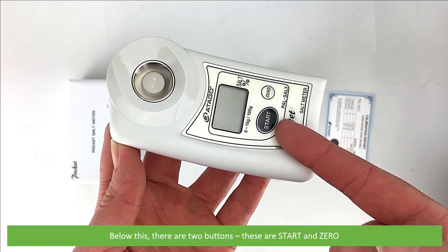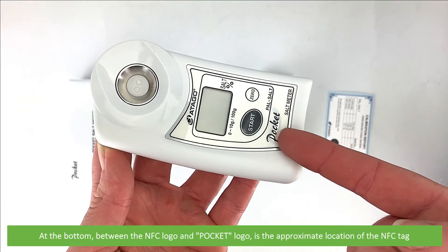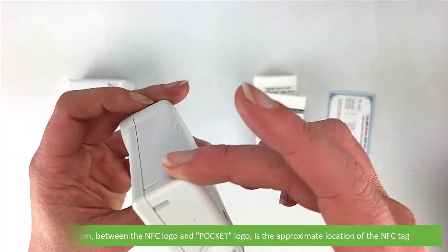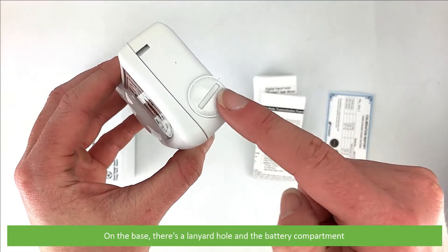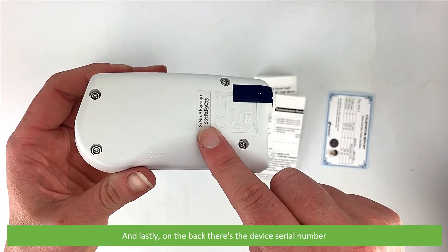Below this there are two buttons: start and zero. At the bottom, between the NFC logo and the pocket logo, is the approximate location of the NFC tag. On the base there's a lanyard hole and the battery compartment, and on the back there's the device serial number.